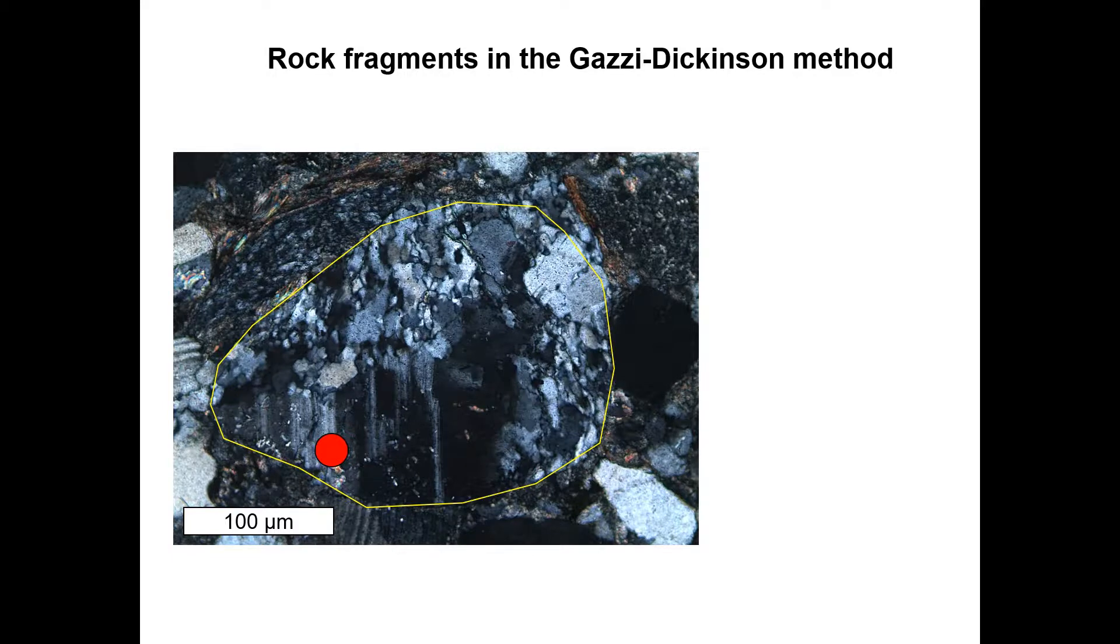Here's a real example. This is a grain consisting of quartz and feldspar. The scale here tells us that most of the individual minerals are well above our 63 micron limit, which means we have to count the individual mineral. In this case here, our crosshairs landed on the feldspar grain. So this belongs to the F-pole.